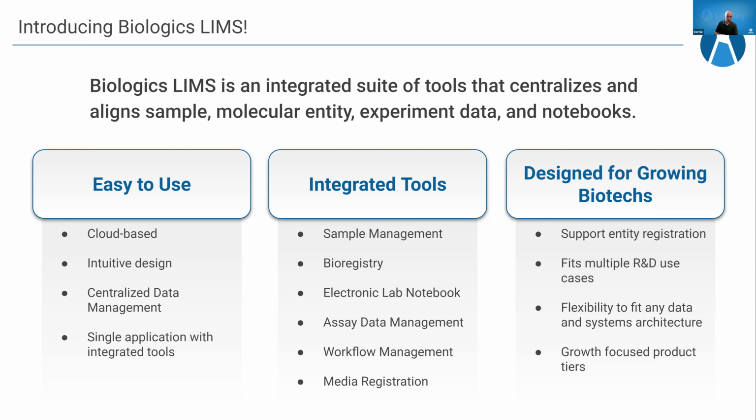Spreadsheets can solve lots of problems, but they are just about the least built-to-purpose tool out there. They also have to scale. Something that serves a scientist a few at a time, but falls down at a larger scale, is simply going to become a burden. Similarly, something that serves those individuals reasonably well, but doesn't serve other members or teams at the institution simultaneously, is also going to present some downstream hurdles.